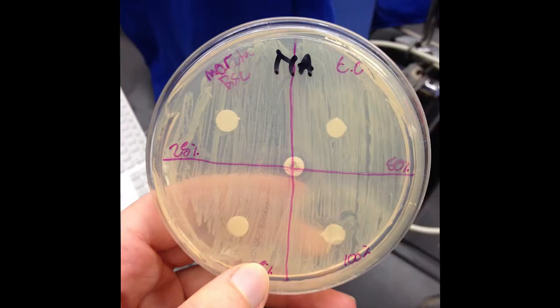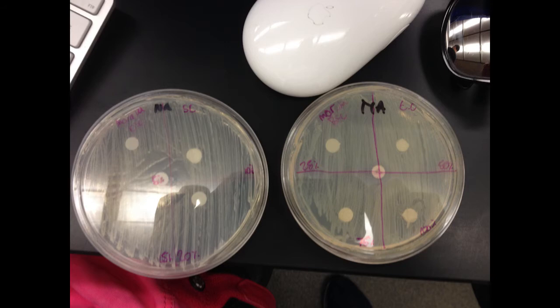Even in the 100% concentration, the bacteria was still growing, since the water did not pull away from the bacteria. Also, there could have been some experimental values that could have gone wrong. In one of the plates, the ampicillin still didn't inhibit the bacteria, but in another one it did. In this method, the standard test for antibiotics, the test that we did on honey did not work.